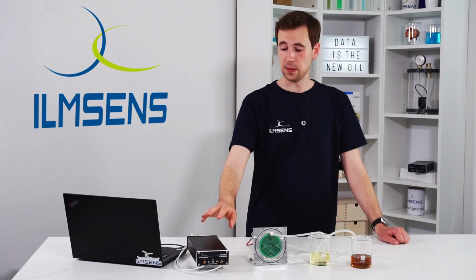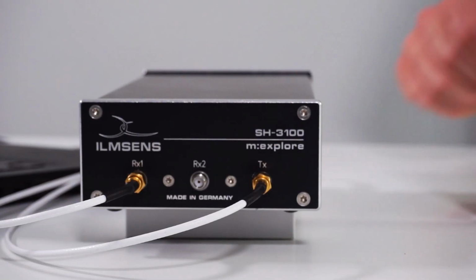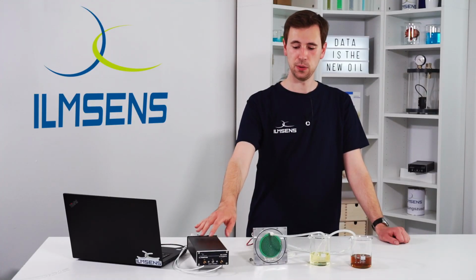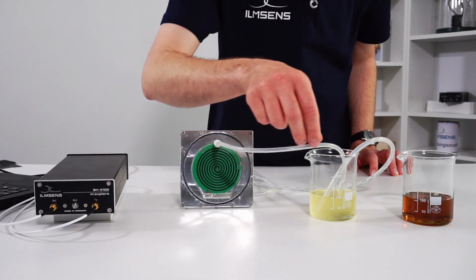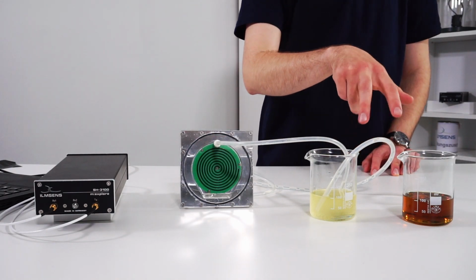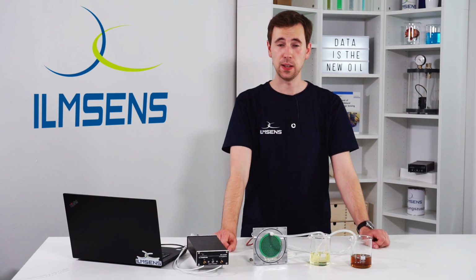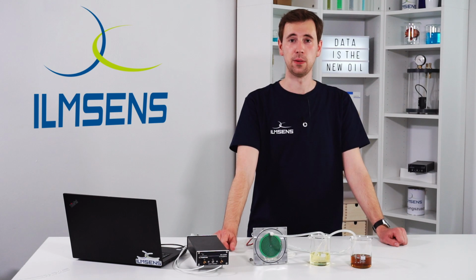Here you can see the main measurement setup that we need for our next test. On the left you can see the M-Explore, the sensor which will introduce an electromagnetic wave into the measurement cell designed for oils. And on the right you can see two different kinds of oils. One is a plant-based oil, rapeseed oil, and the other one is a synthetic oil for engines.